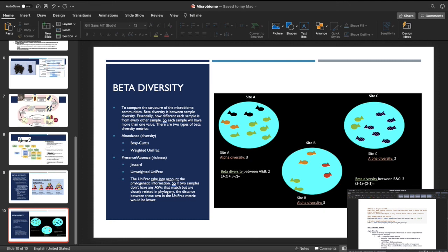So now, another good one, which is in the actual tutorial, to explain the difference between evenness and richness is a great one with the trees. Community 2 is actually the worst community because it's totally dominated by species A, these trees. So that would be a community whose microbiome is not as great, and this is actually a better microbiome, in terms of bacterial species.